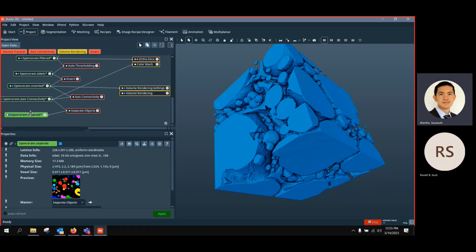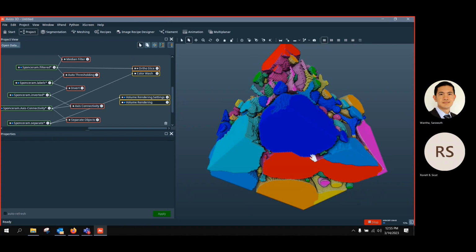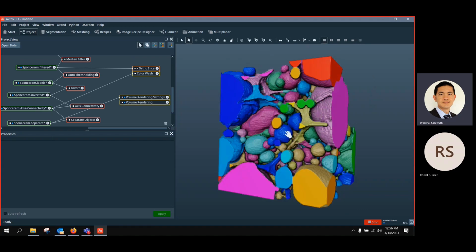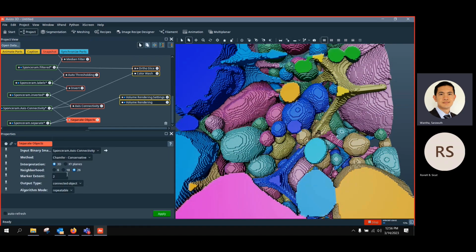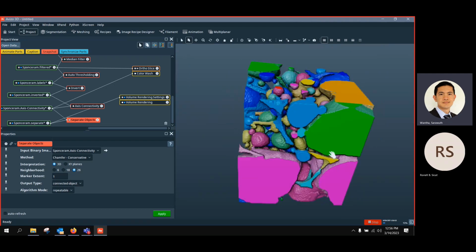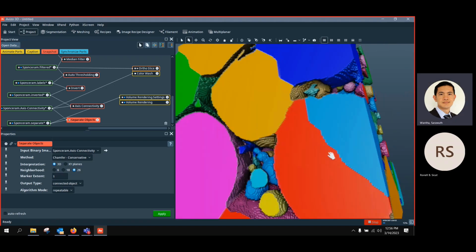Now we come to the last part of this pore network modeling. After you prepare this data, you will get the final pores that are connected and each of them separated into individual pores. Maybe I could reduce the separate object criterion, because some objects are still not separated well. So I reduce marker extent to 1 to have more objects separated. That's the maximum we could do. Everything else is separated, and even here it's not good enough, but anyway.